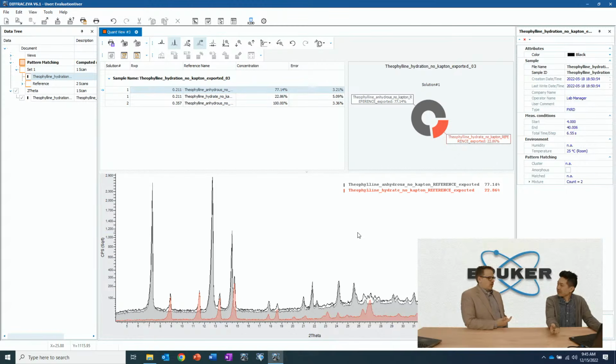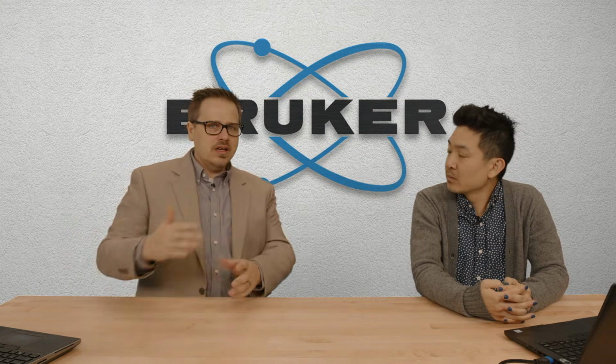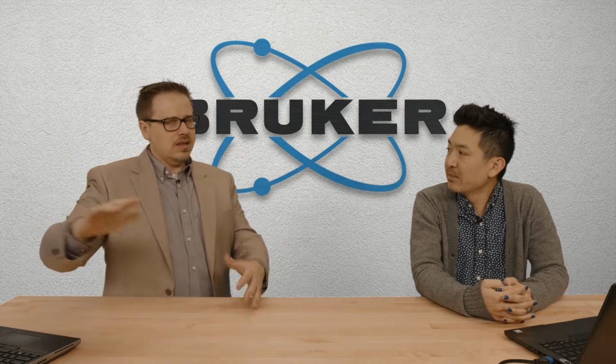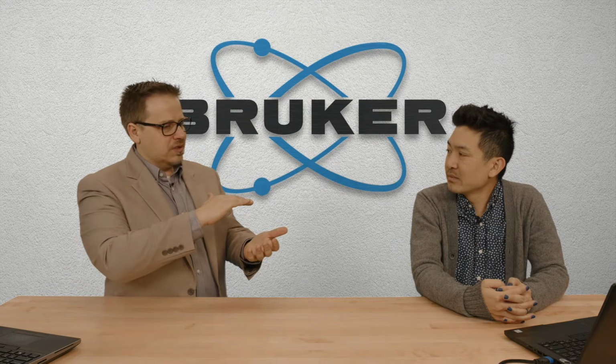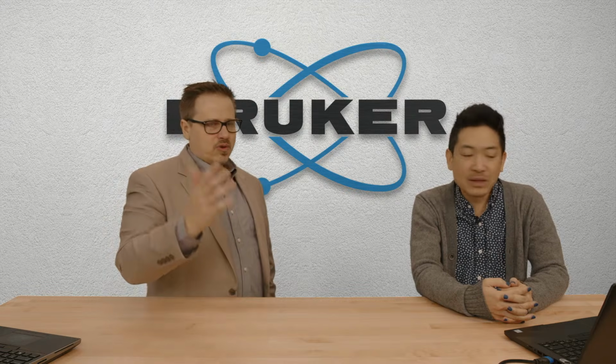I remember once there were some government forestry groups. They're looking at wood, cellulose, but they're really concerned about where that wood comes from. Does it come from a certain type of tree in a certain area? Depending on where you grow it, even though it's just a really broad peak, they do have signature patterns. So what they were looking at was actually just the broad humps, and they have a whole database of these broad humps that they use for determining this. A lot of fibers, any sort of synthetic: did this come from a rainforest versus the proper areas?